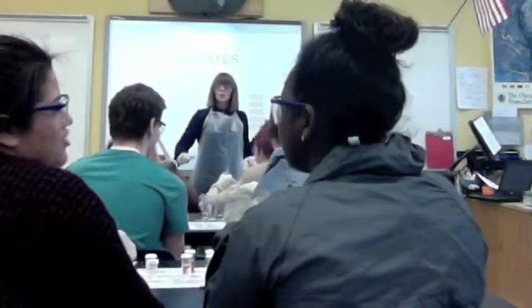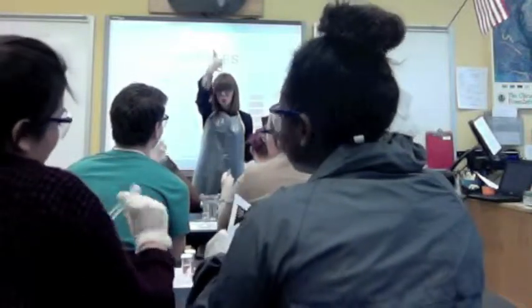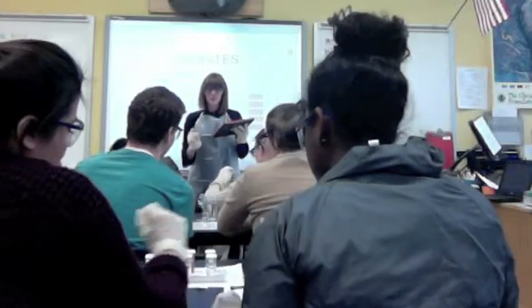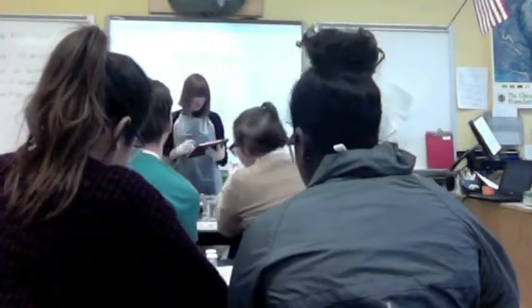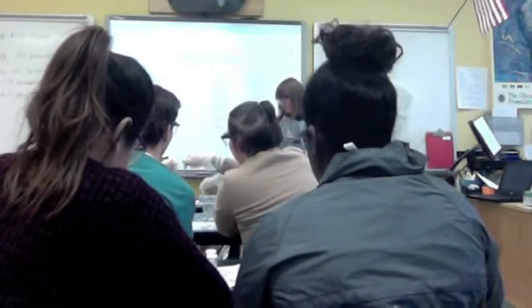All right. Those of you rotating the dissolved oxygen, you may put that down. We are still waiting 5 minutes before analyzing it, but the rotation can stop. I think it got cold. It's okay. Totally fine.